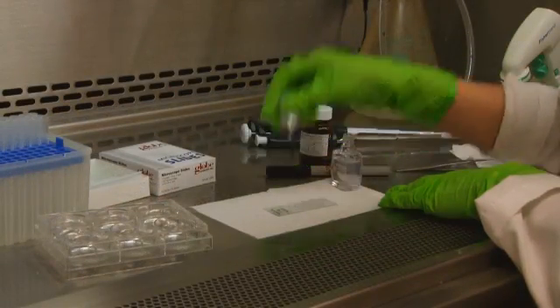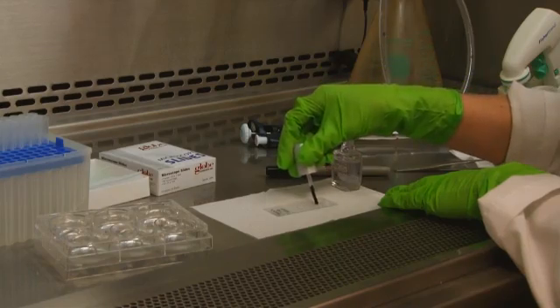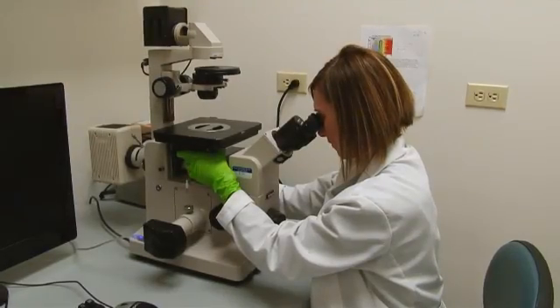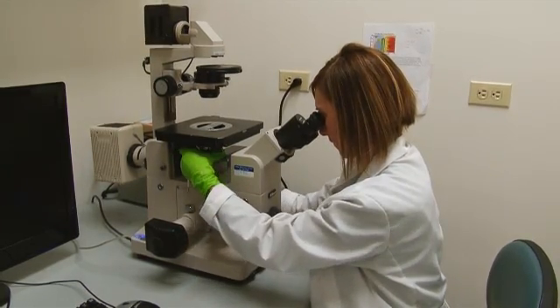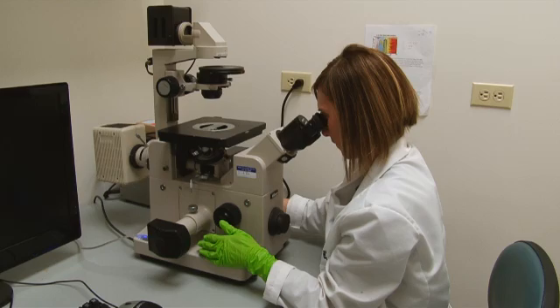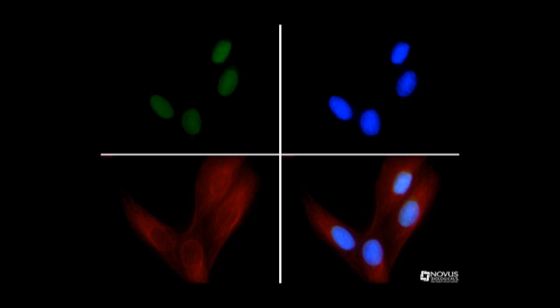Clear fingernail polish can be used to seal the cover slip and prevent it from drying out. Slides can now be visualized under a microscope or stored at minus 20 or 4 degrees Celsius in a dark slide box. Limiting the amount of time each slide is exposed to the microscope's light will aid in prolonging the fluorescent signal and prevent photobleaching.